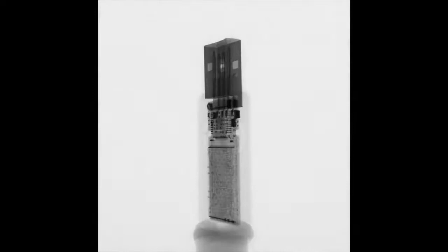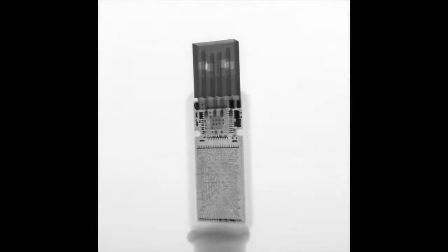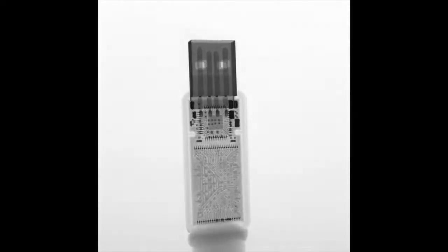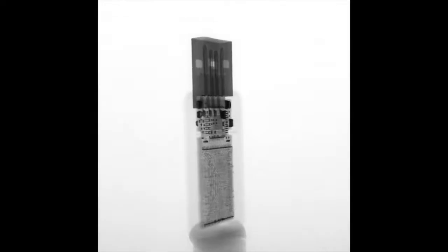However, in the final reconstructed cross-section images of MicroCT data, this black and white color pattern is flipped so that white areas represent dense and black areas represent less dense material. This is much like what you would see in an x-ray at a doctor's office.